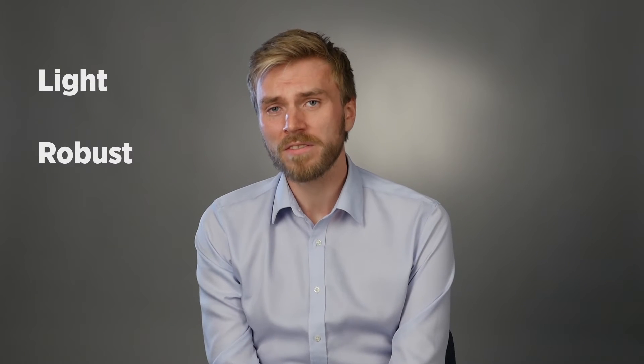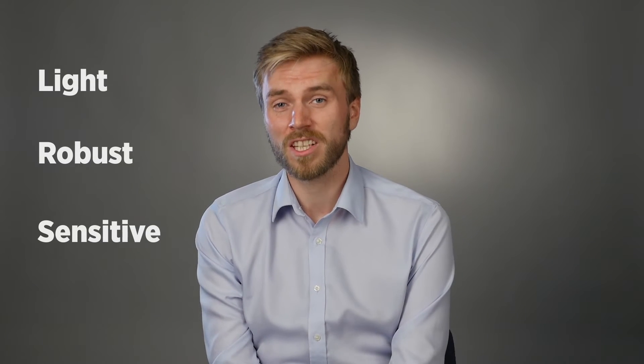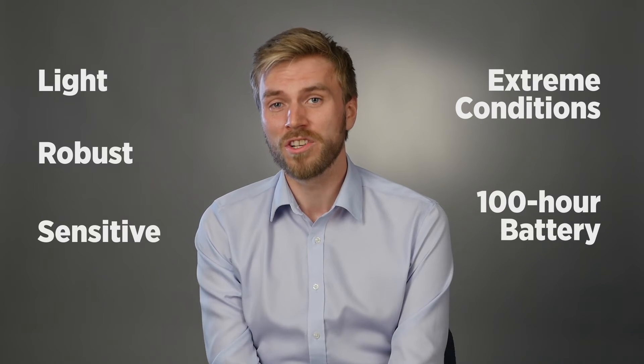At this point, I asked Vazivai what are the advantages of using the LCD 3.3 over other types of detectors. He told me that it is light, robust, detects a wide variety of chemical compounds, it can be used in extreme conditions, and it has a 100-hour battery life.